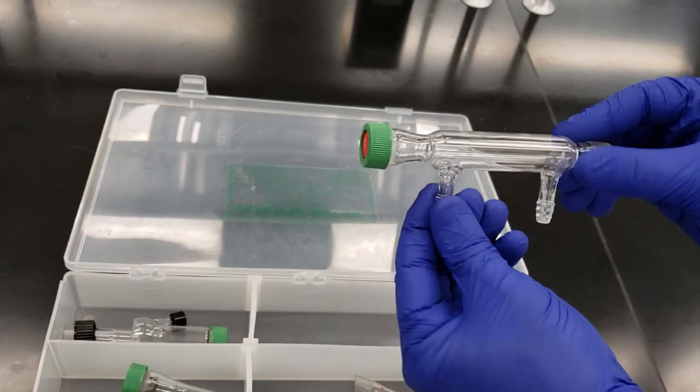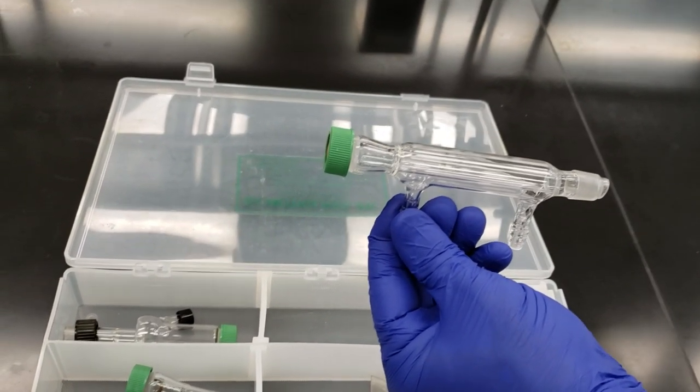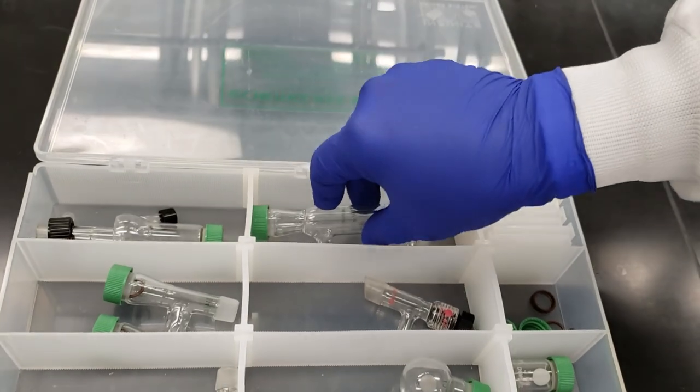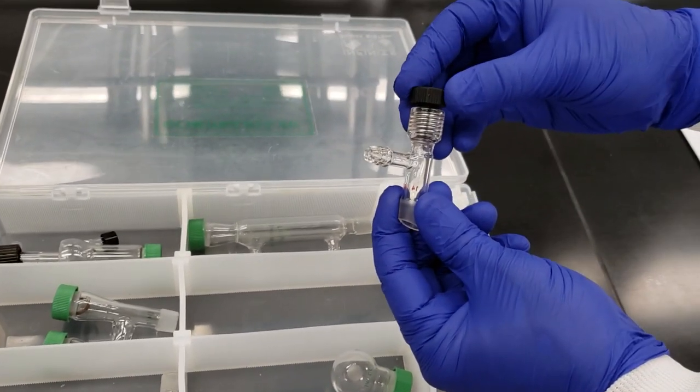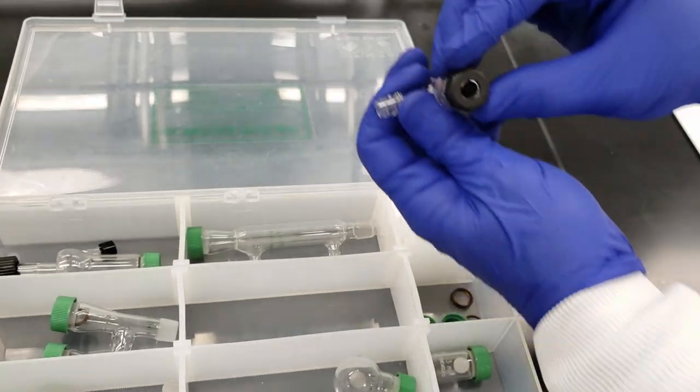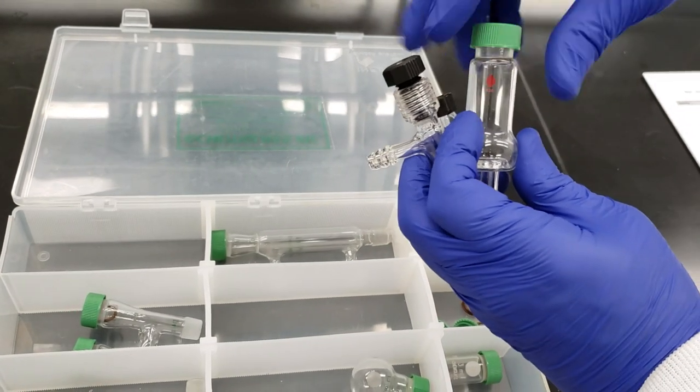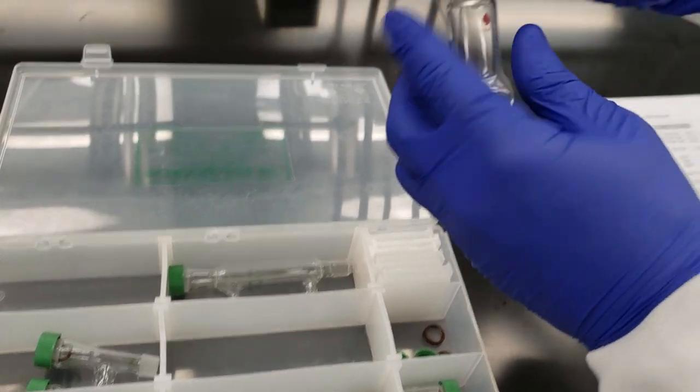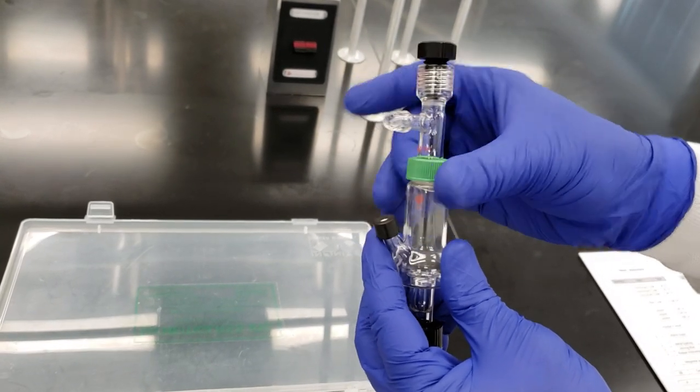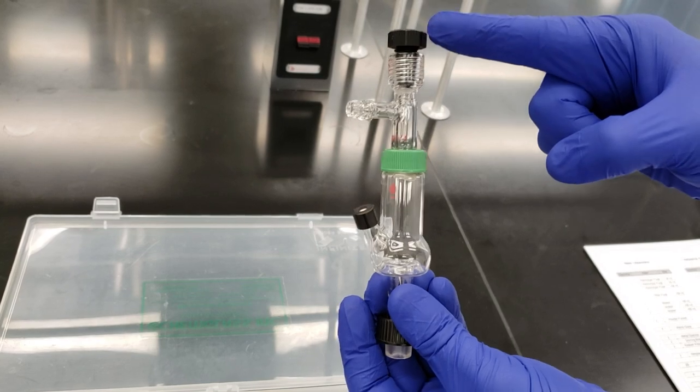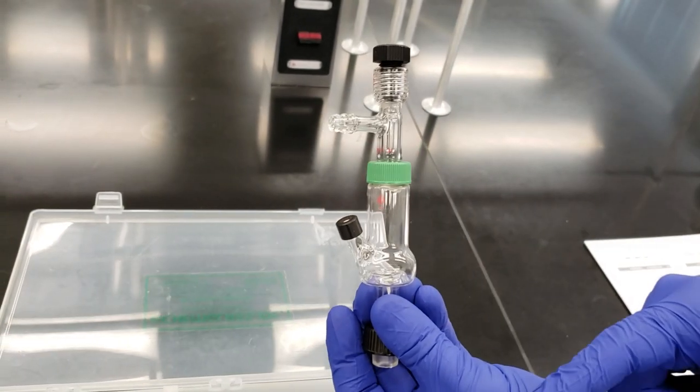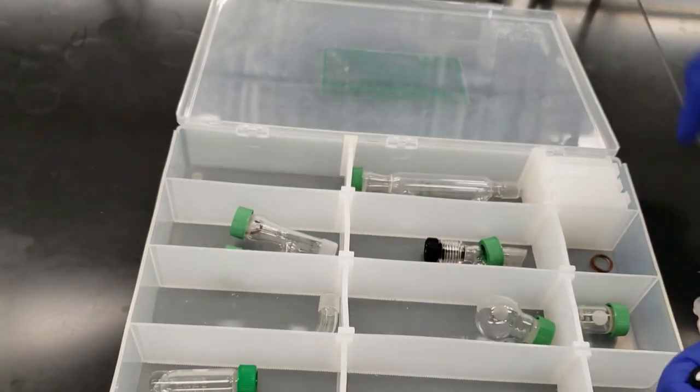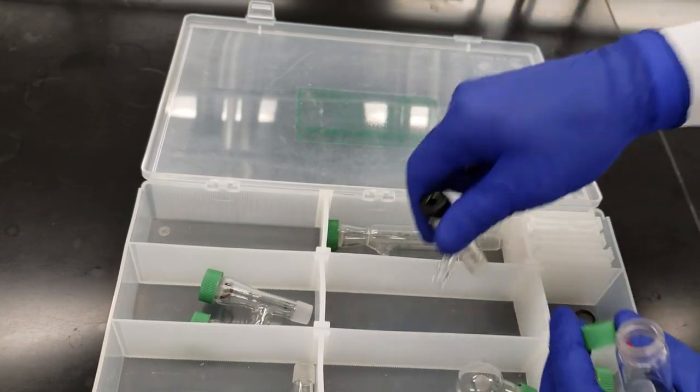We have a micro condenser, the smaller version from drawer two, with inlet and outlet to run water through the inner jacket and cool vapors. We have our thermometer adapter where you place the alcohol thermometer through the center. It fits together with the Hickman still head using the ground glass joint and screw cap, holding the thermometer in place to measure temperature during distillation or reflux.